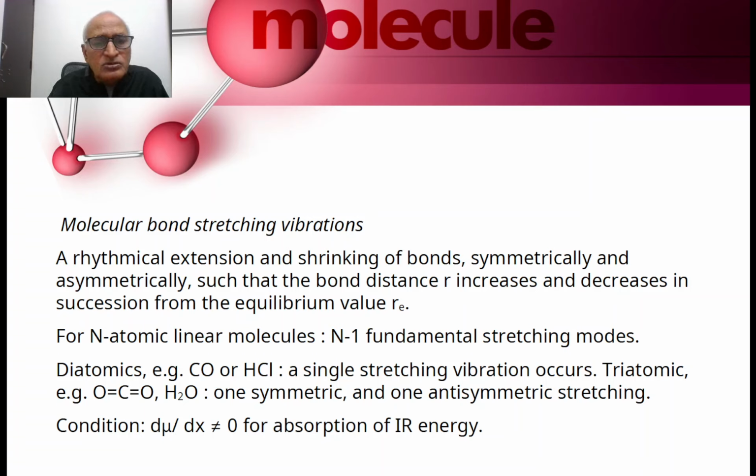Here I should tell you, for carbon dioxide, the antisymmetric stretching vibration is IR active because it is accompanied by a change in the dipole moment of the molecule during vibration. But the symmetric stretching vibration does not involve any change in the dipole, therefore it is IR inactive. However, this mode is Raman active. When we study Raman spectrometry at a later stage, then I will explain to you why for centrosymmetric molecules, the IR inactive vibrations are necessarily Raman active and vice versa.